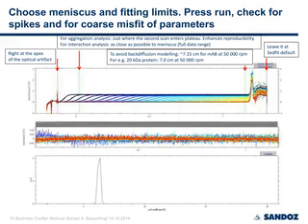The bottom fitting limit is usually defined by the back diffusion. If you have a small molecule and a low speed, the back diffusion may reach quite far into the solution column. You can calculate this using the simulation function of Sedfit, but for a monoclonal antibody, which is quite large, at 50,000 RPM, everything is pelleted at the bottom and the back diffusion region is quite small.